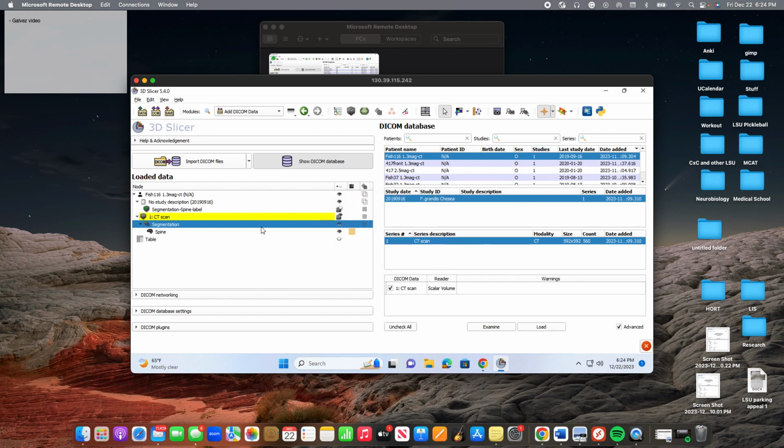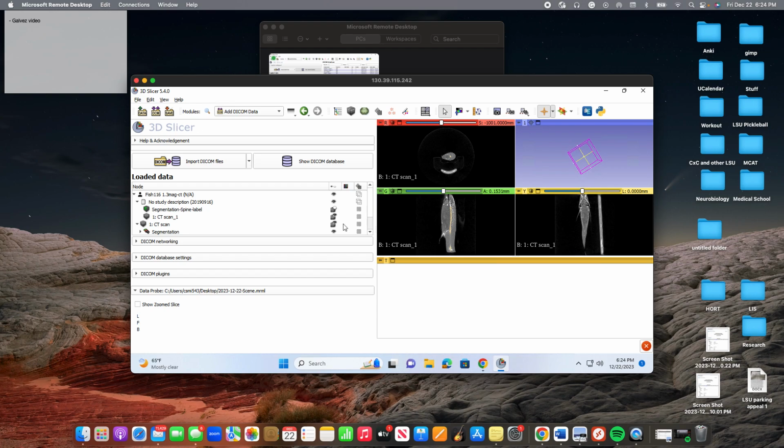You'll load it back in and you'll just get the overlap. It's going to be marked as CT scan 1, so yeah. Or sorry, it's going to be a CT scan. Or I guess it allows for CT scan 1 to work. I don't know, but you can use that in your own way, and that's how you get that back. So that's pretty much everything. Like I said, I have a lot of stuff in the workflow. I hope that covers everything.